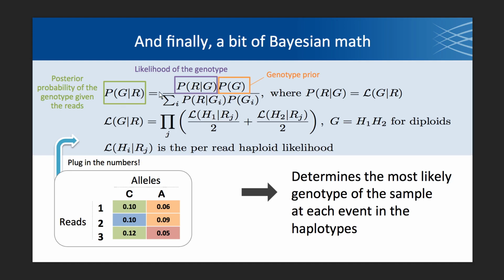And then in theory, we take a posterior probability of the genotype, because what you're going to get out of that equation are a bunch of likelihoods, and likelihoods are not guaranteed to add up to 1 in the same way that probabilities are. So we need to get posterior probabilities out of them, and we apply Bayes' rule. And at this point in the game, we're only going to apply a flat genotype prior. So we're going to say that each genotype is equally likely. We'll look in the genotype refinement workflow at a better way to inform those priors later on.